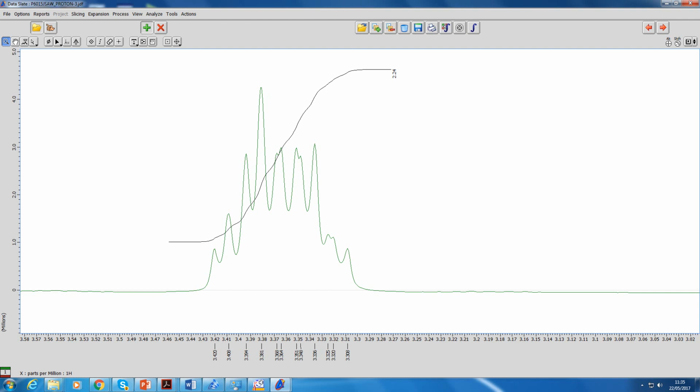No. So we never press the trash can, the bin button, unless you want to start again, because it will just delete everything that's on your screen, and unfortunately there is not an undo button. So try to avoid pressing that. Don't press that. It's the negative next to that. That one? There. Oh yes, that negative frame. That got rid of the overlay there. Okay. So back to whichever the first one was we put on.